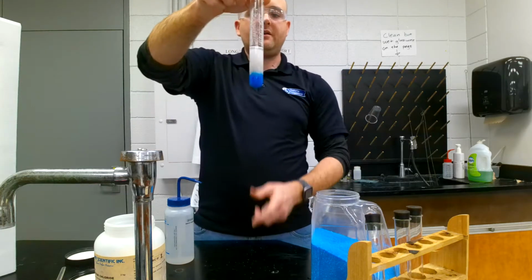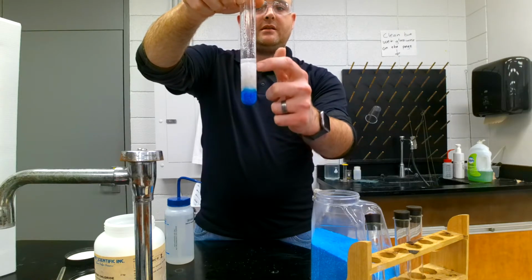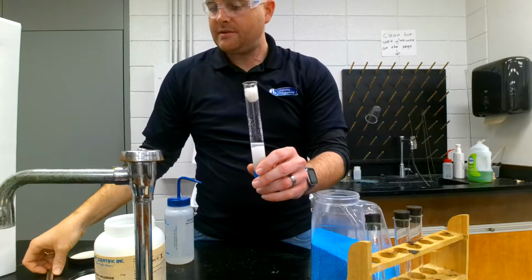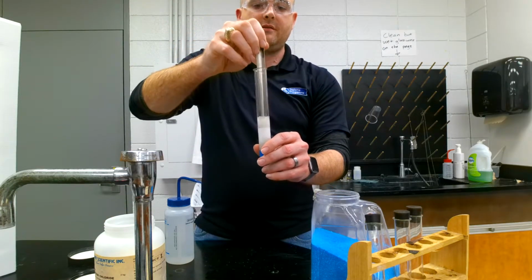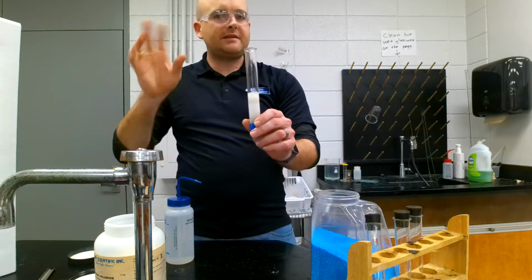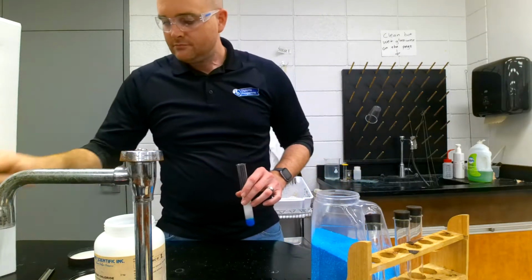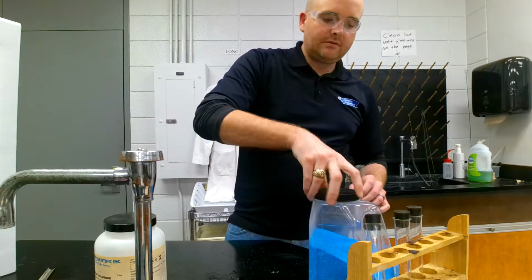So now we have a barrier between the copper sulfate, we have the cotton ball or the nylon, and then we have our salt in the middle. It's very salty. And then we'll put another piece of nylon in there, and we're going to push that all the way down to the bottom. So now the solid substances, even though they may not stay solid, are now not touching each other.